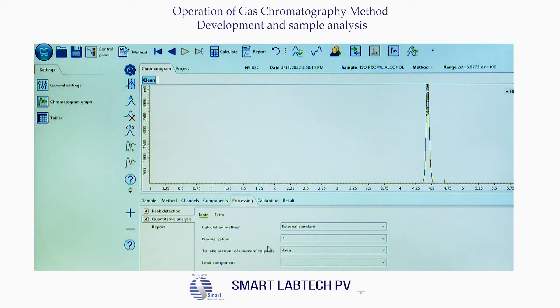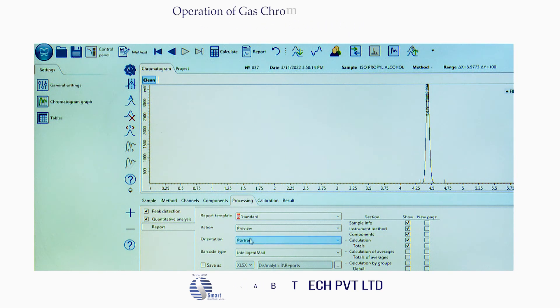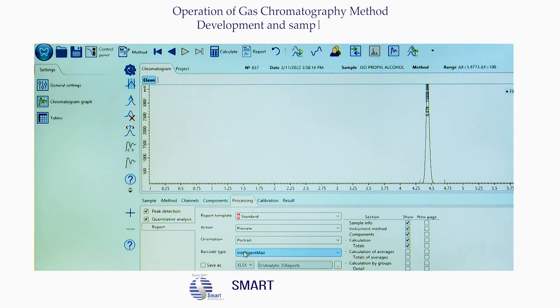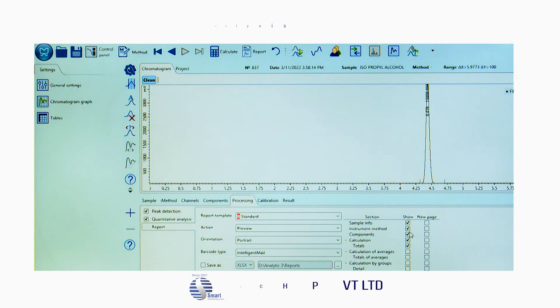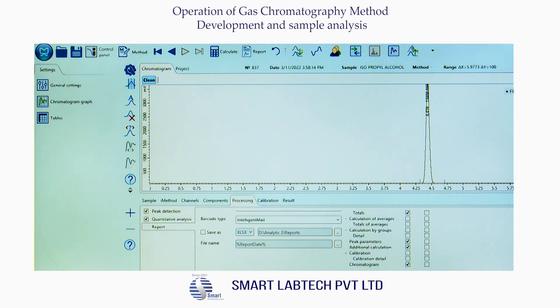Now click on Report. Under report template, select Standard. Under action, select Preview. Under orientation, select Portrait. Under barcode type, select Intelligent Mail. Now under Section, select the report parameters to be displayed on the chromatogram: tick Sample Info, tick Instrument Method, tick Components, tick Calculation, tick Total Percentage, tick Peak Parameters, and tick Chromatogram.